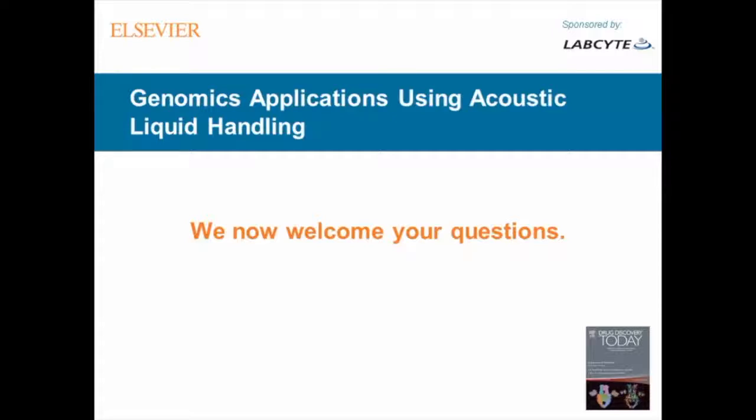Thanks, Steve. That's a good question. We're actively involved in that area. It's obviously very popular to be able to isolate single cells and interrogate them as one. So we can approach that from two different aspects. One, at the DNA level, we could do the whole genome amplification in a miniaturized reaction and get very good results in that particular case. And then also there's a fair amount of work being done throughout the world with transcriptome analysis with SmartSeq, either version 2 or version 4. And there are several manuscripts in preparation. So we're hopeful to see those results and data come out in the peer-reviewed journals sooner rather than later, but they are coming.